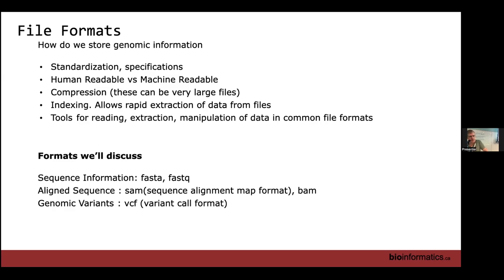The intention is, most of the files we create are human readable versus machine readable. We do want to have them organized in a way that software can read and work with them. We also often take these files and compress them. They can be very, very large, so compressing makes them smaller, easier to move around, and easier to work with. And there are a lot of tools designed to work with the compressed files, so we don't actually have to decompress them to work with them.